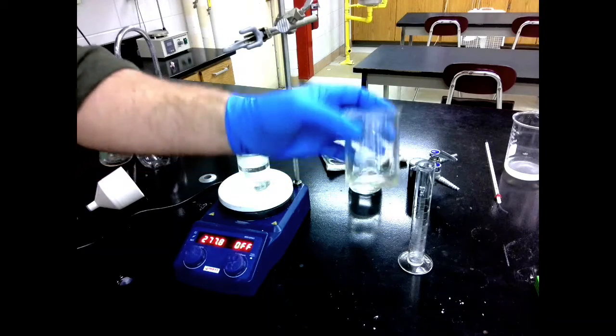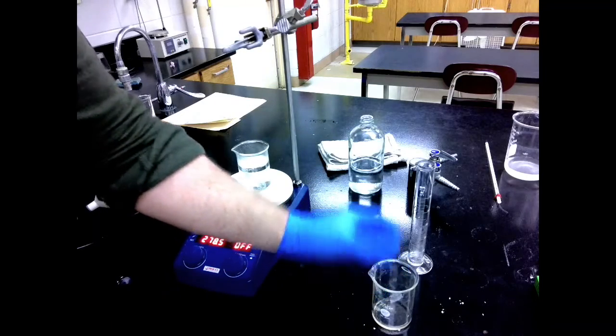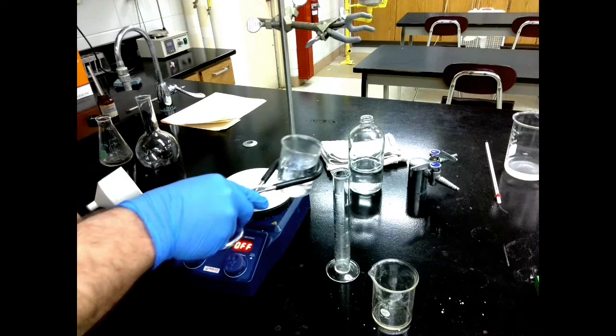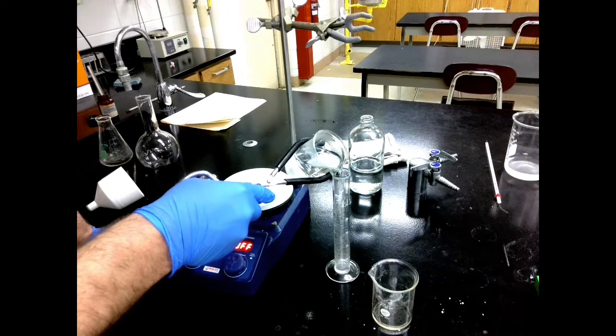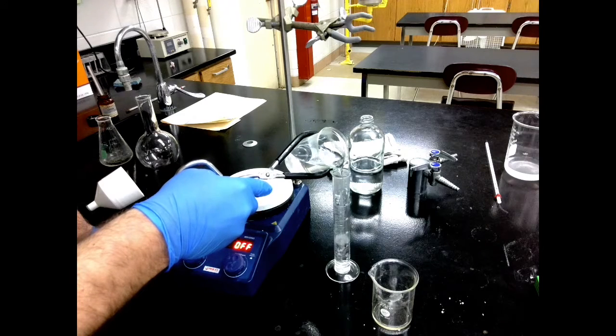dissolved. So, all of my aspirin is now dissolved in this, and so I need to measure out 60 milliliters of my boiling hot water. Now this is a situation where it's going to be okay if it's not exact, because I am pouring boiling water, so we're going to need to be safe here. So pour that in.